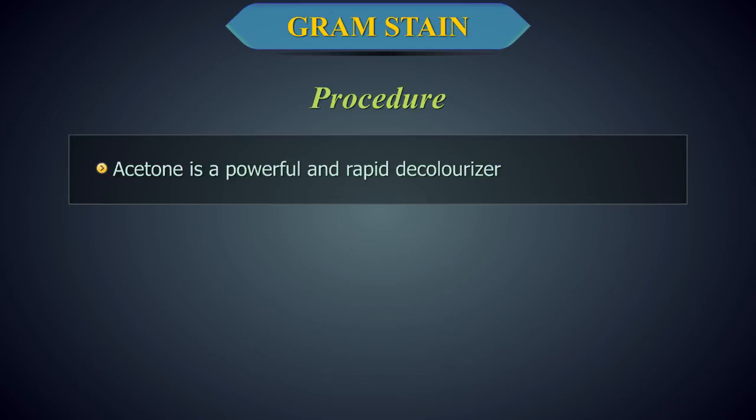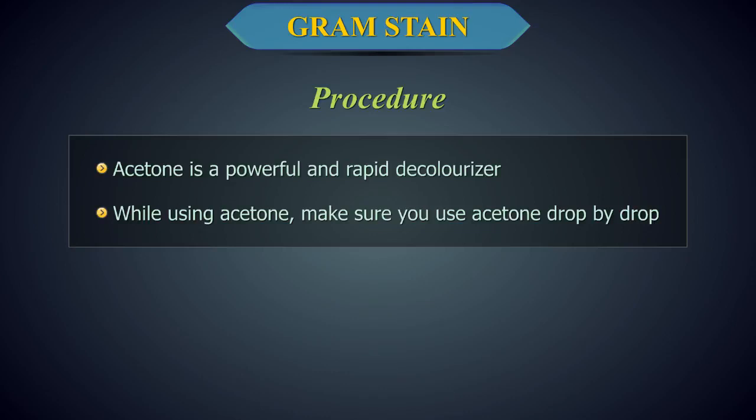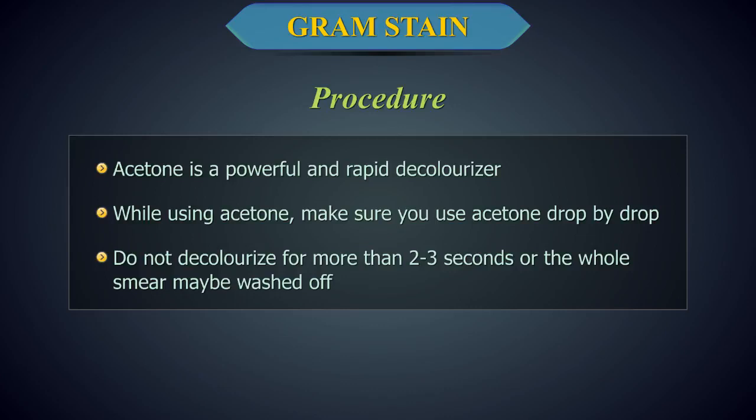Acetone is a powerful and rapid decolorizer. So, while using acetone, make sure to use it drop by drop. Do not decolorize for more than 2 to 3 seconds, or the whole smear may be washed off.